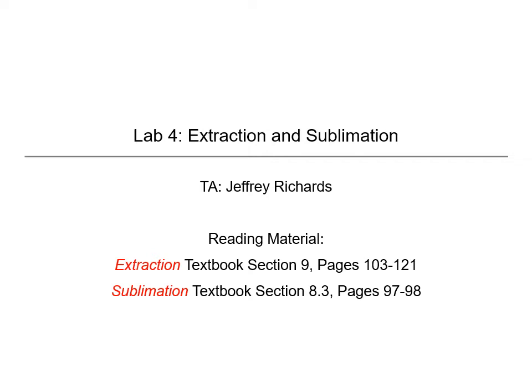Hello everyone. Lab number 4 will cover the topics of extraction and sublimation. More information on this topic can be found in the textbook in section 9, pages 103 to 121, and section 8.3, pages 97 to 98.